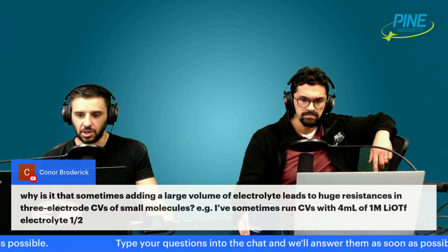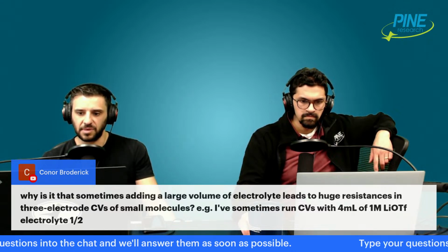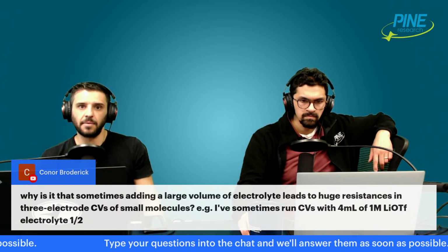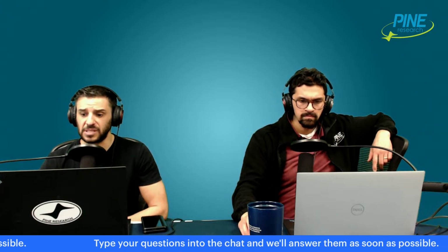But you need to really think about proximity and pressure when you're thinking about these battery materials. You just have to go down that assumption that a typical 3 electrode setup is not likely going to be very fruitful for you. So Connor, please follow up if you want any more specifics about your setup and everything. I'm happy to talk about it some more.